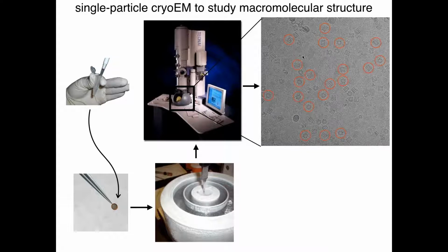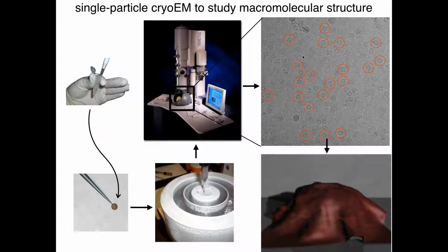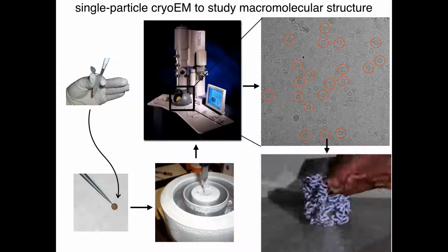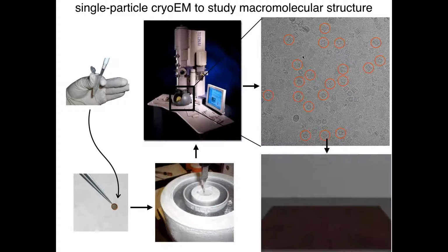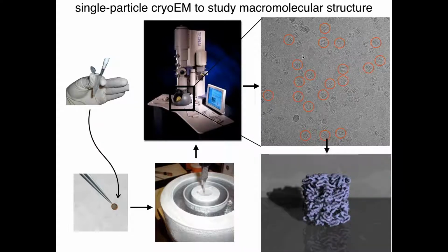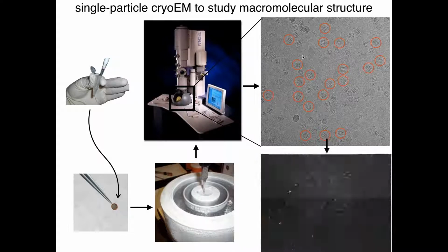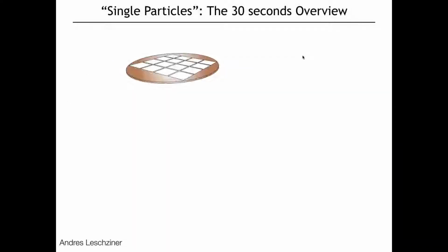The job during data analysis is then to select out these particles, and then through a number of image processing operations, which I'll introduce in the next slide, come out with a three-dimensional reconstruction. This particular part of the pipeline has been very actively and rapidly developing over the last two to three decades, and is still actively developing new tools and new methods.